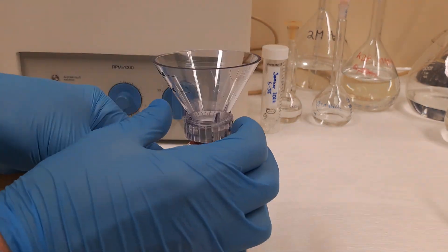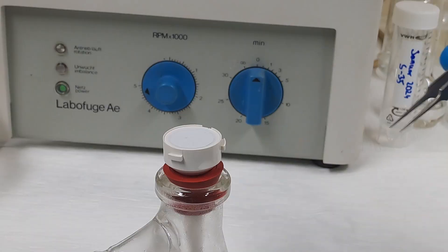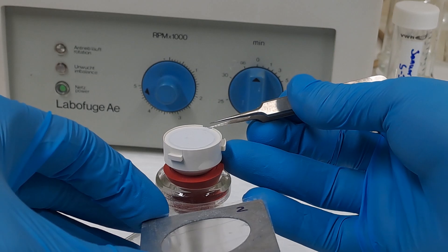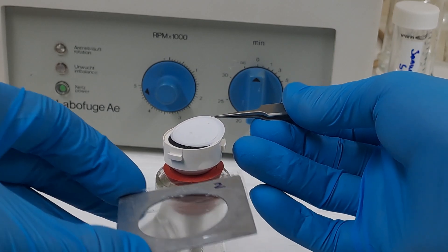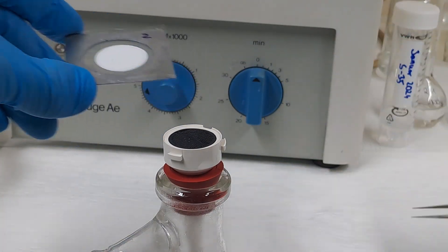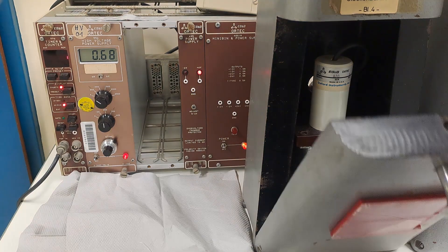After filtration, carefully transfer the membrane filter onto the prepared adhesive tape using tweezers. The barium sulfate filter cake should be facing up on the sticky tape side of the tape within the frame.